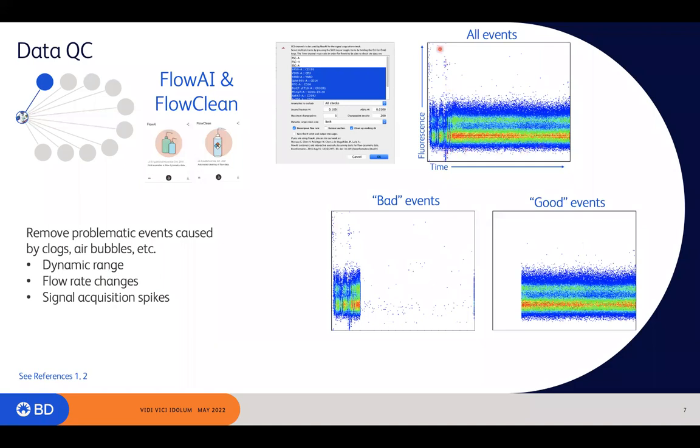You also have some data points up here that are shifted upward. So the data points taken in and around a clog are not what you want to filter down into your analysis, right? These guys up here are going to look like false positives of some kind. God forbid they turn up to be a rare population or MRD, and then likewise, the opposite would happen with respect to a false negative, perhaps.